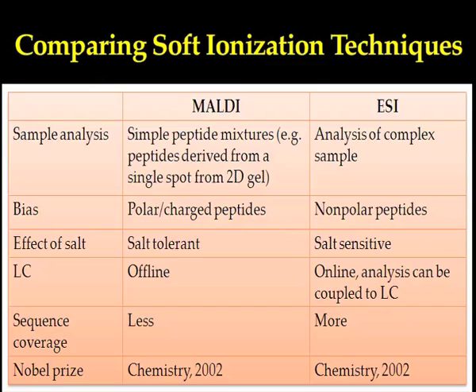For the proteomic applications, the sequence coverage is less in MALDI as compared to the electrospray ionization. Both MALDI and ESI developments were awarded with the Nobel Prize.